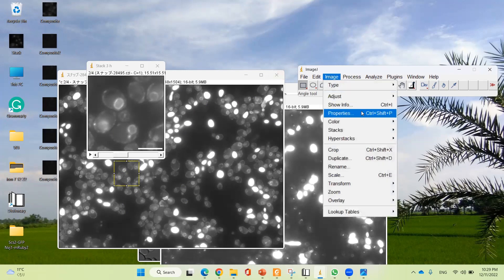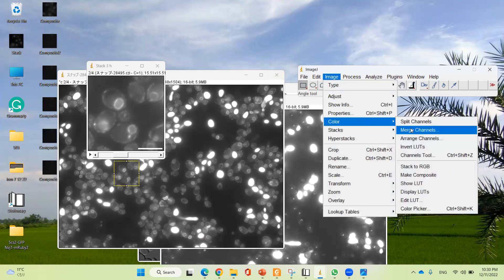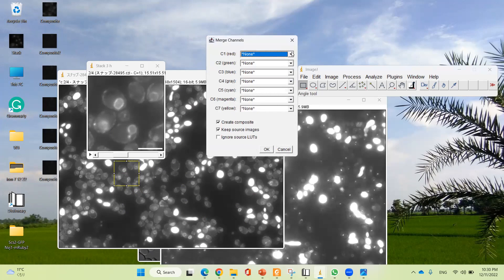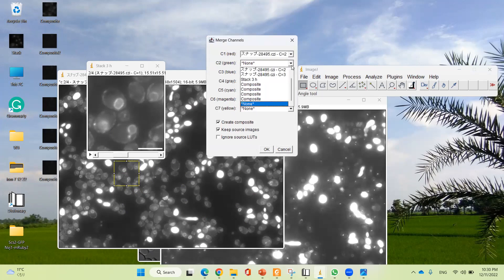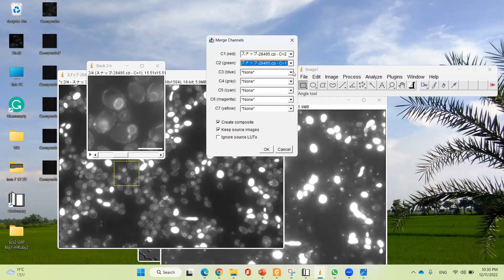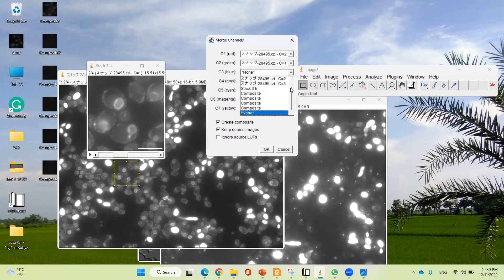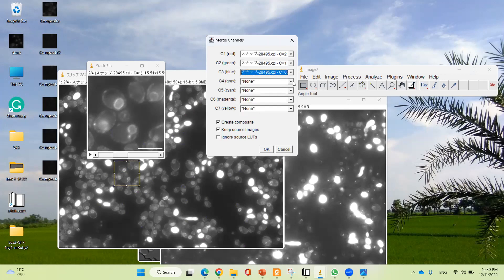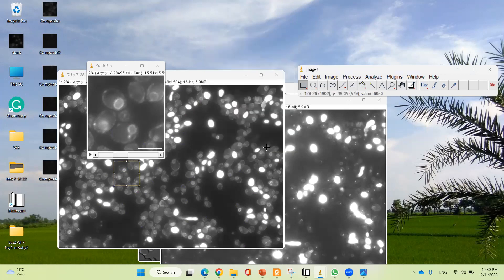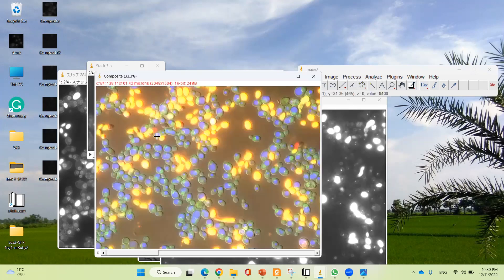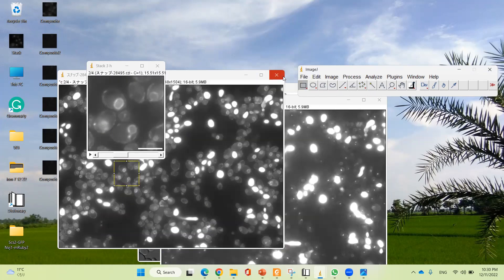The final merge will be the 4-color image. Red is C2, green is C1, blue is C0, and gray is C3. Click OK. This is the merged 4-color image — all 4 colors in a single image.